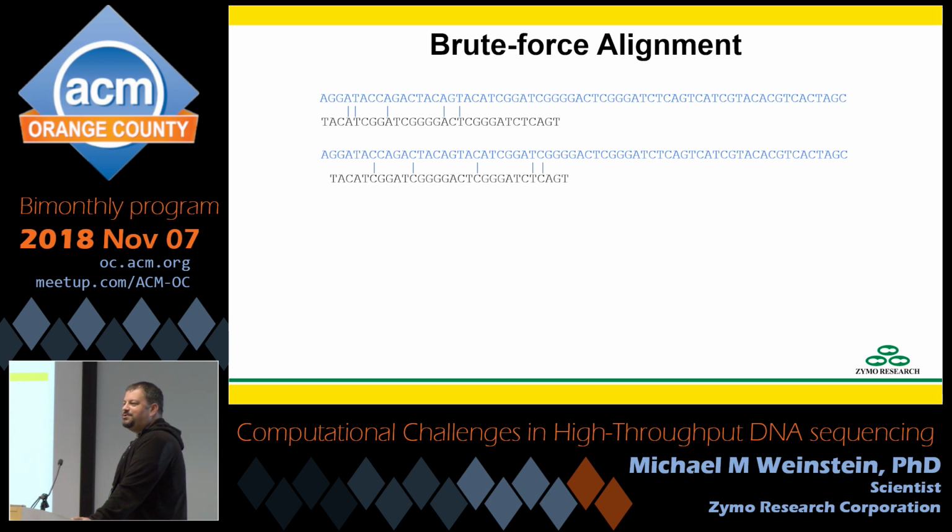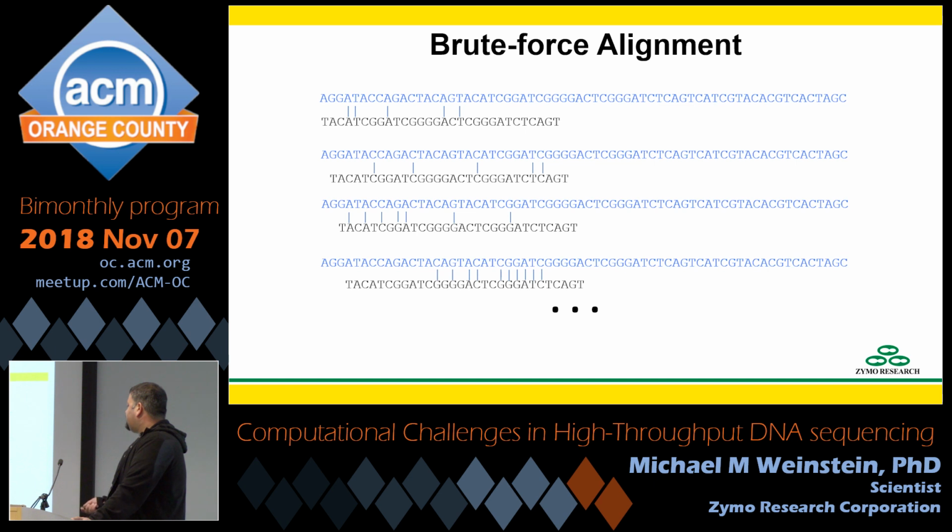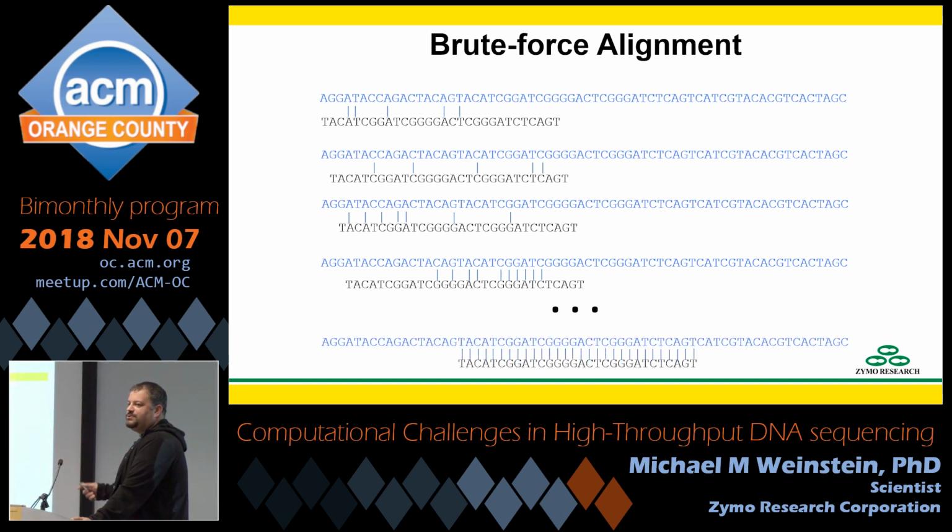We're getting an idea here that you get a certain number of matches just by random chance. Keep going, you get a few more matches. Keep going, hey, you get a lot of matches, but still within the random chance area. Eventually, you get to a position where it matches perfectly. Except you still need to keep going across the genome because you need to make sure it doesn't match perfectly anywhere else.